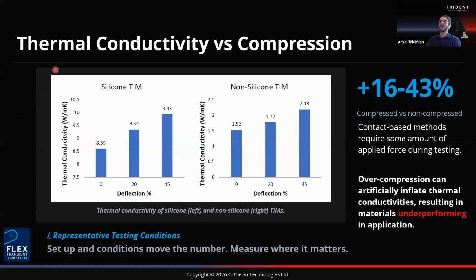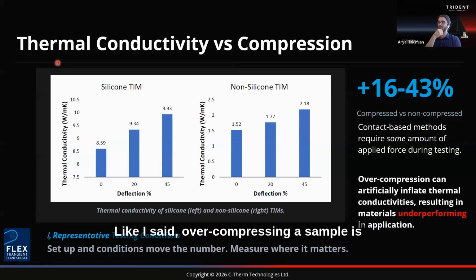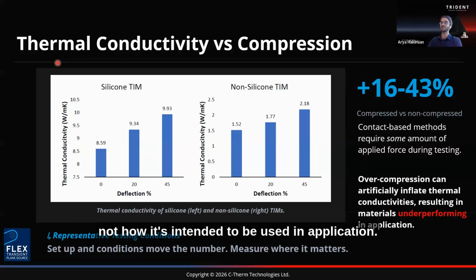So, thermal conductivity and your setup. Compression. Like I said, over-compressing a sample is something that can artificially inflate the value if that's not how it's intended to be used in application.